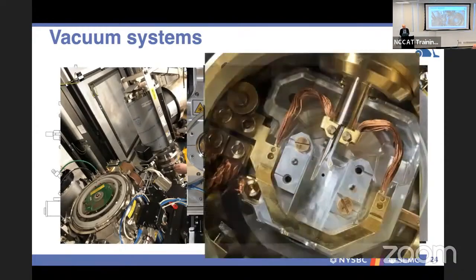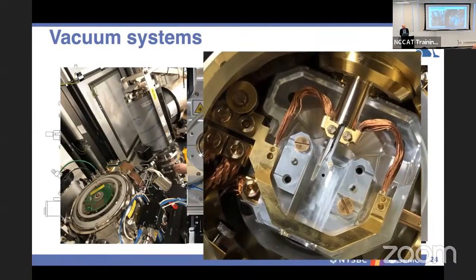Something to make note, here's an example of a microscope split. If you look over there, basically the metal rods that are holding out, that's actually holding a grid. So imagine that's 3 millimeters. There's a little hole in there. It's about a 1 millimeter hole, give or take.